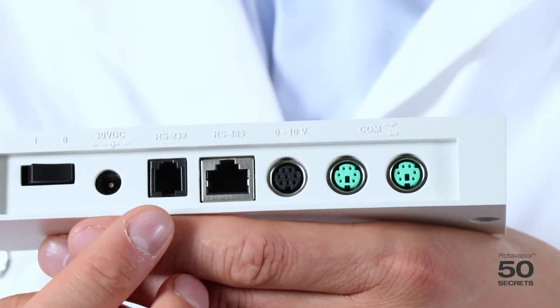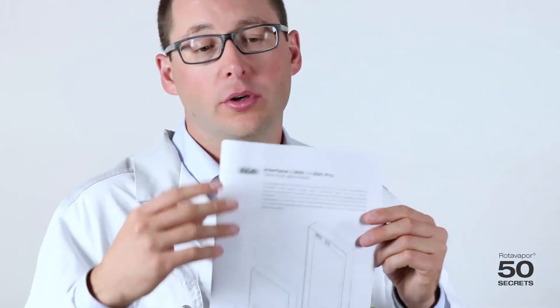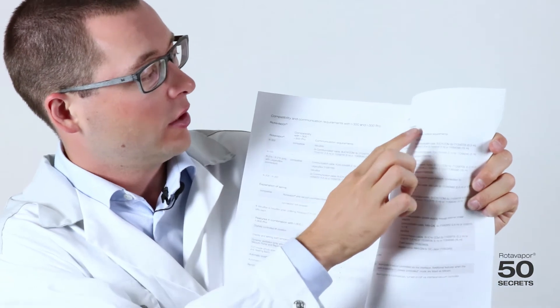The RS232 port is currently not in use. For more information, we have gathered and prepared a lot of information in our technical data sheets. The technical data sheets — for example the i300 and i300 Pro — have a chapter called compatibility, which shows what is compatible with what, and what cables and other requirements are needed.